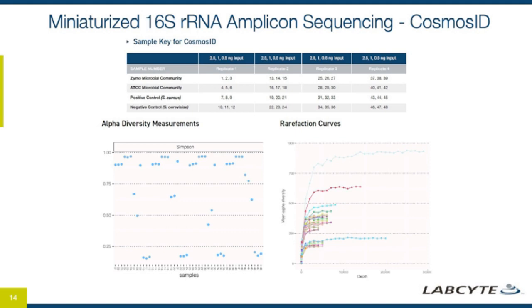The middle cluster that you see is ATCC, and once again they cluster well and they saturate diversity in comparison to reads at about the same point. There are two outliers on top. Those were manual controls that were just extra abundant in terms of reads, and so that's why you see that there was so much more there.